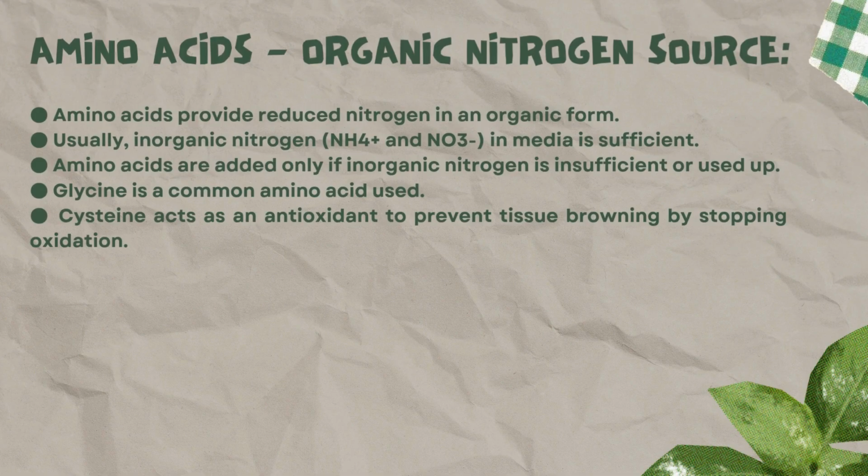Next, a key player from the world of plant tissue culture media, amino acids. Why do we sometimes add amino acids to the media, and what's their real role? First, amino acids provide reduced nitrogen in an organic form which plants can quickly and easily absorb.